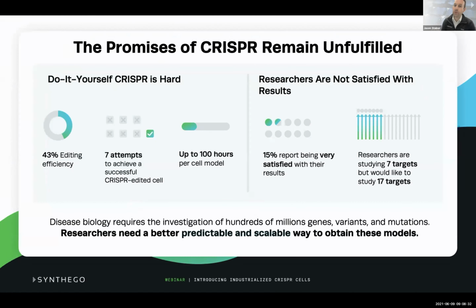But I would say that CRISPR is still actually not a particularly easy technology. It is a co-opted microbial immune system. It is still complex and a bit stochastic, and so optimizing it and doing it effectively is still a challenge, despite its democratization and ease of perceived use. Many researchers are really not achieving the results they desire, and the effort itself is relatively laborious.